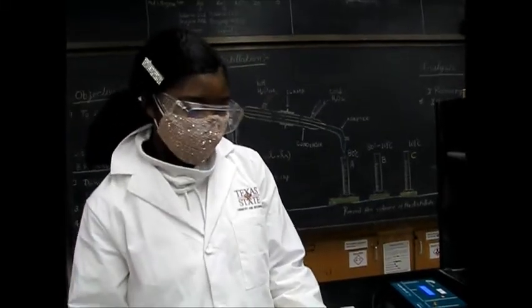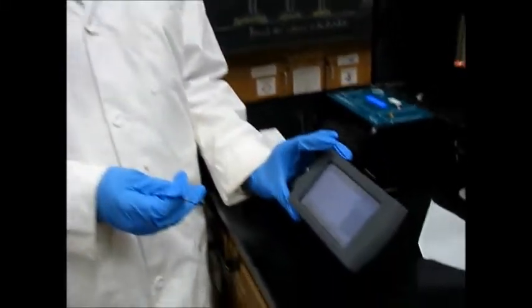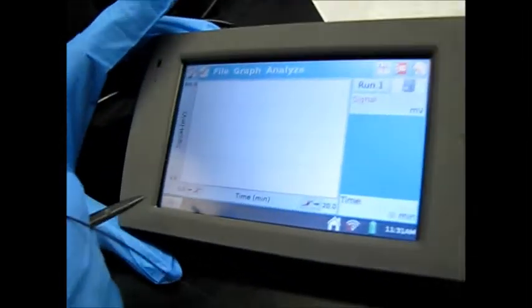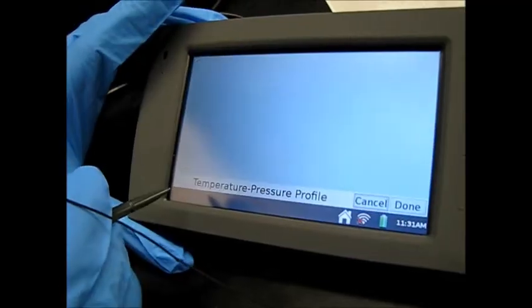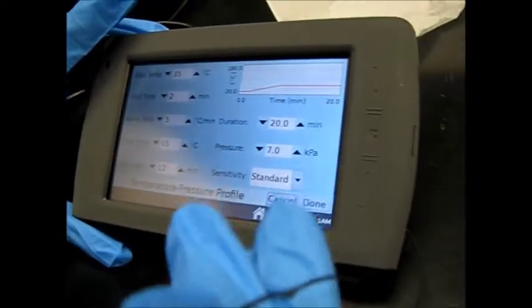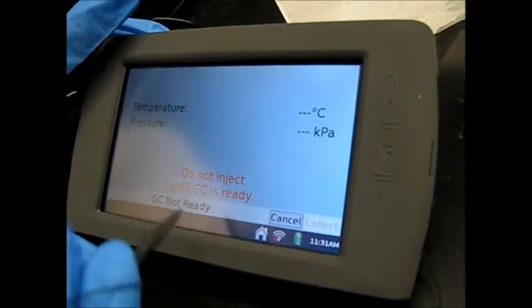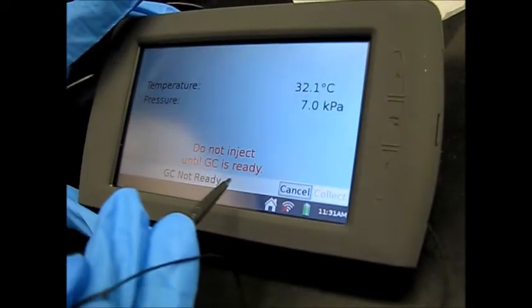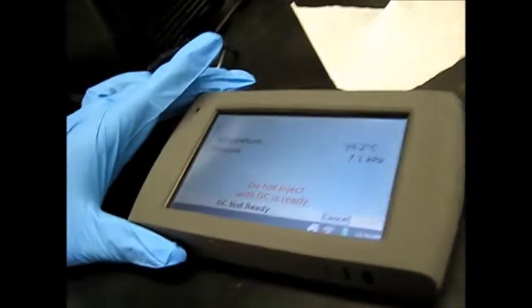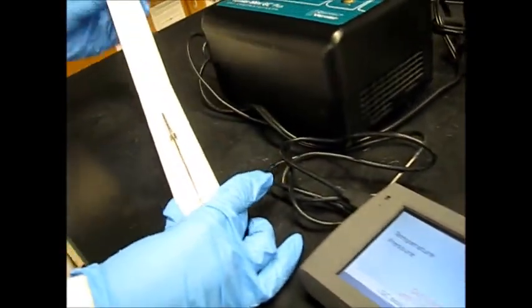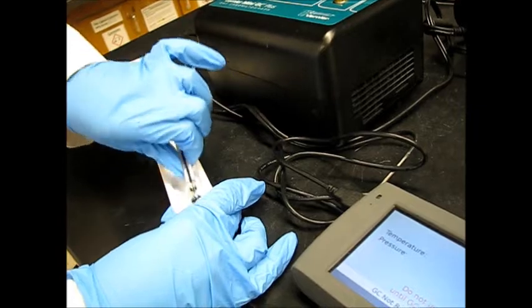So after 15-20 minutes, we're going to come here to get our GC ready. So I'm going to start by pressing play. It's going to pop this up and then I'm going to press done. And now it says do not inject until the GC is ready. So now we're going to wait. While I was doing that, I'm going to grab my syringe and I'm going to clean it and rinse it with my sample.